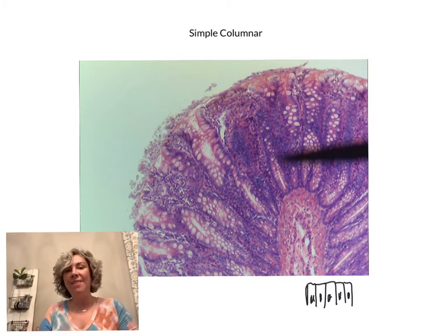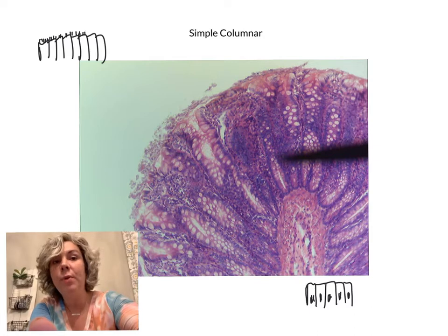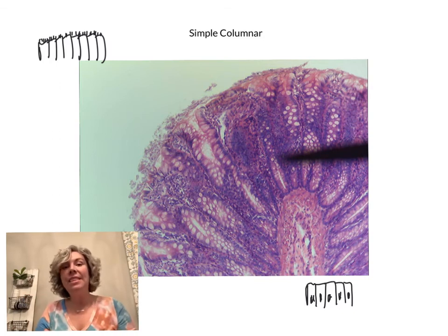So it's possible to have ciliated simple columnar, in which case you will have these column-like cells all in a row, and then there'll be these little hair-like structures on the surface. Now remember, we learned this from chapter 3, cilia are these hair-like projections that move in a sweeping motion, and they move structures past their surface. Inside the female reproductive tract, the fallopian tubes, or uterine tubes, sometimes they're called, are actually lined with ciliated simple columnar epithelial tissue.